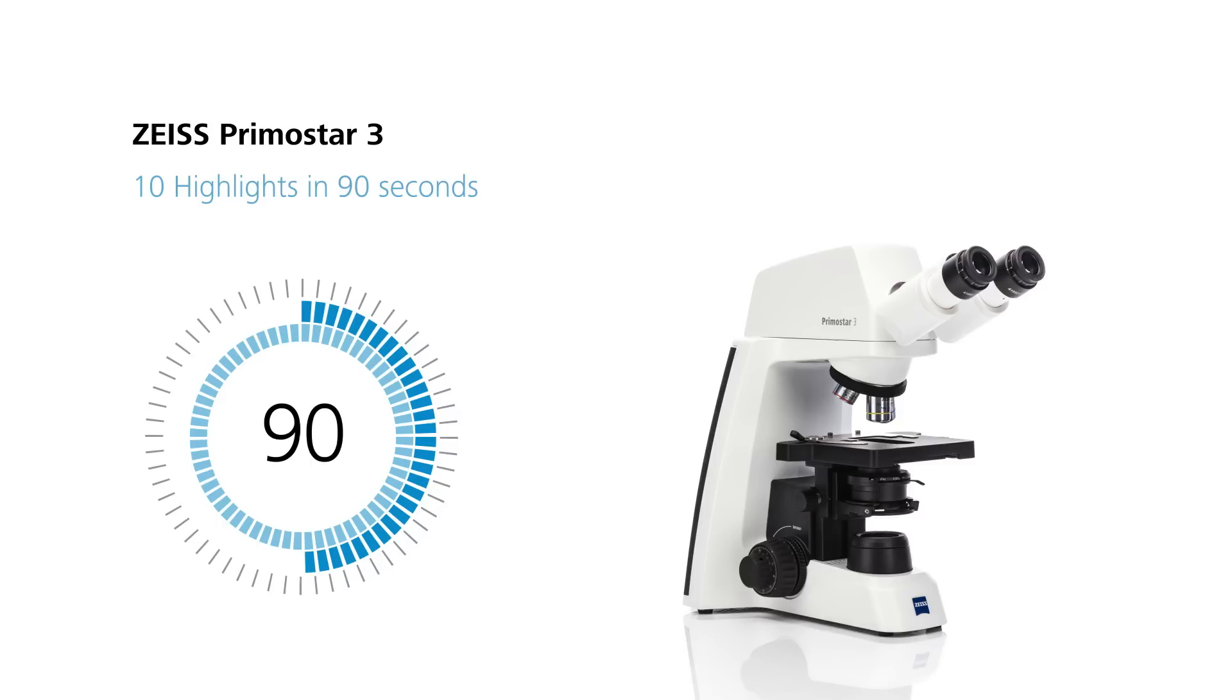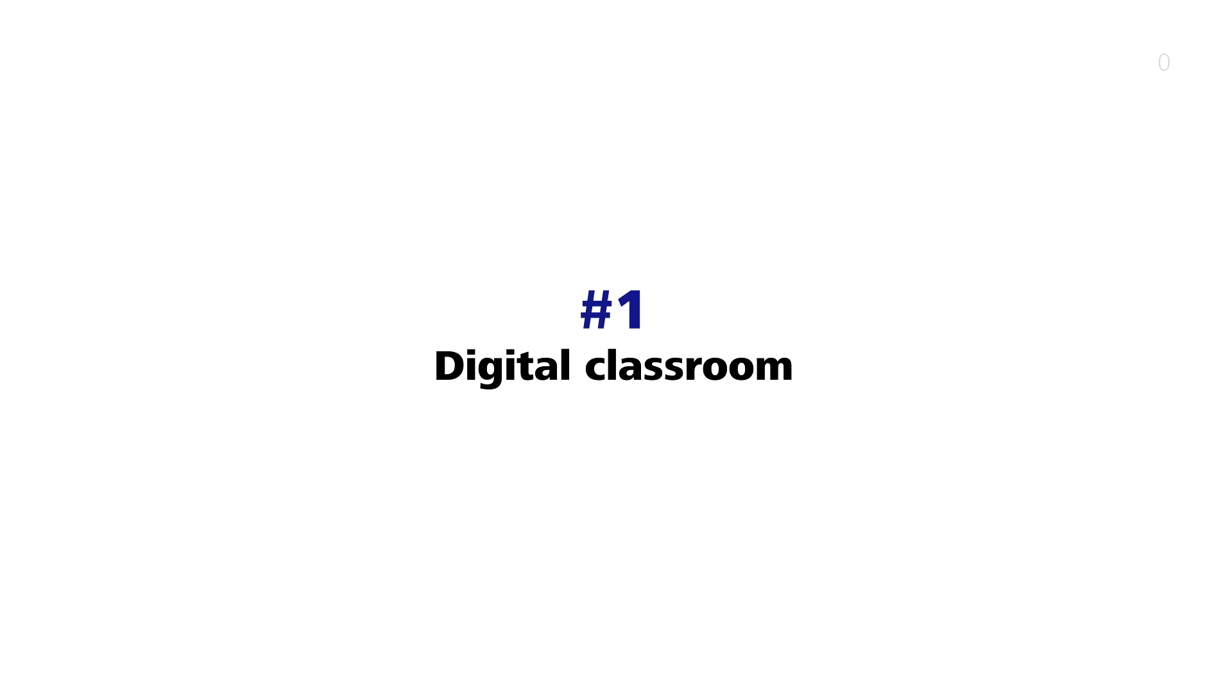Zeiss PrimoStar 3, your robust yet compact microscope for digital teaching and routine lab work. Ten highlights in 90 seconds.